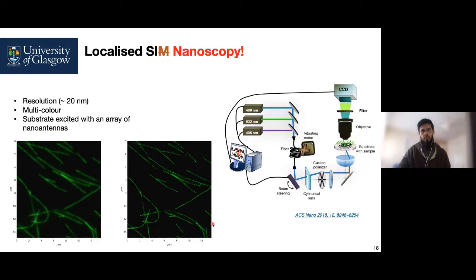of skills. So if you are a student, now is the time to develop skills that are multidimensional. You would have seen the application of deep learning or machine learning everywhere. And this is one prime example of the application of deep learning, which is gaining a lot of traction in the past year: how to reconstruct super resolution imaging through deep learning.